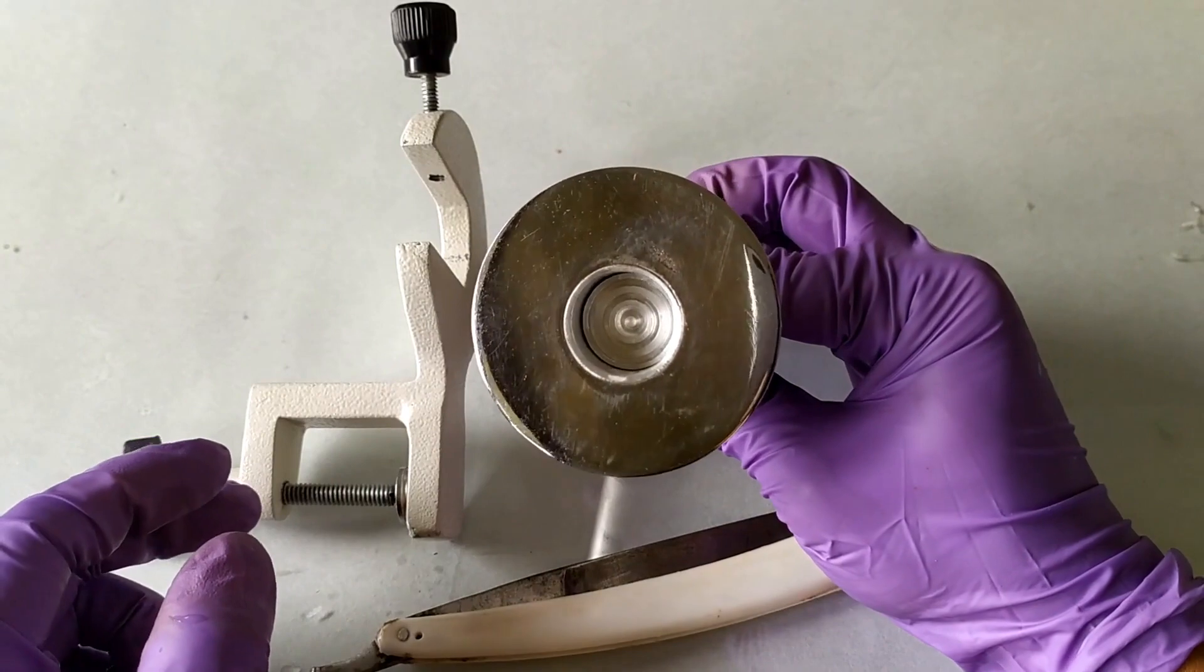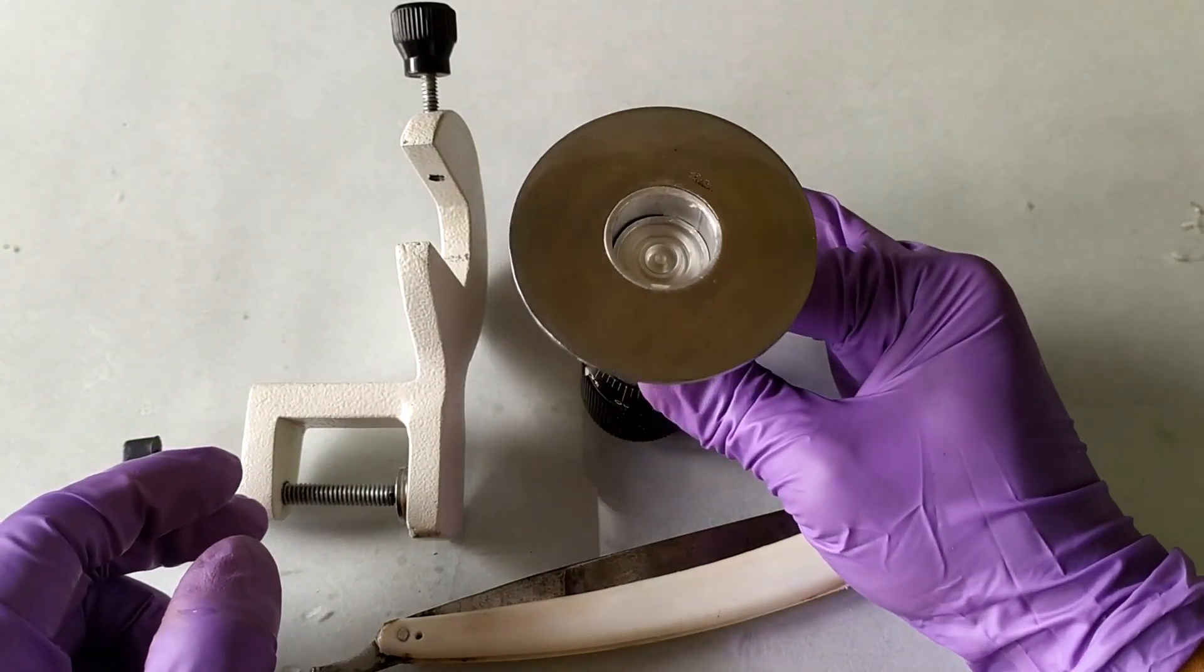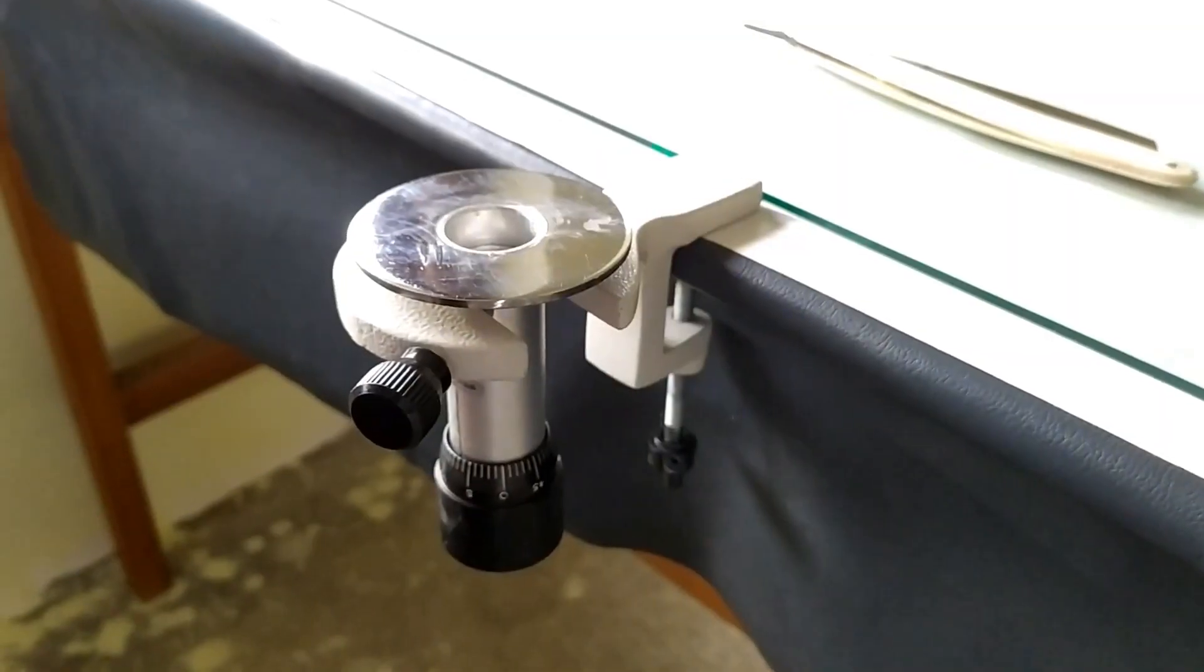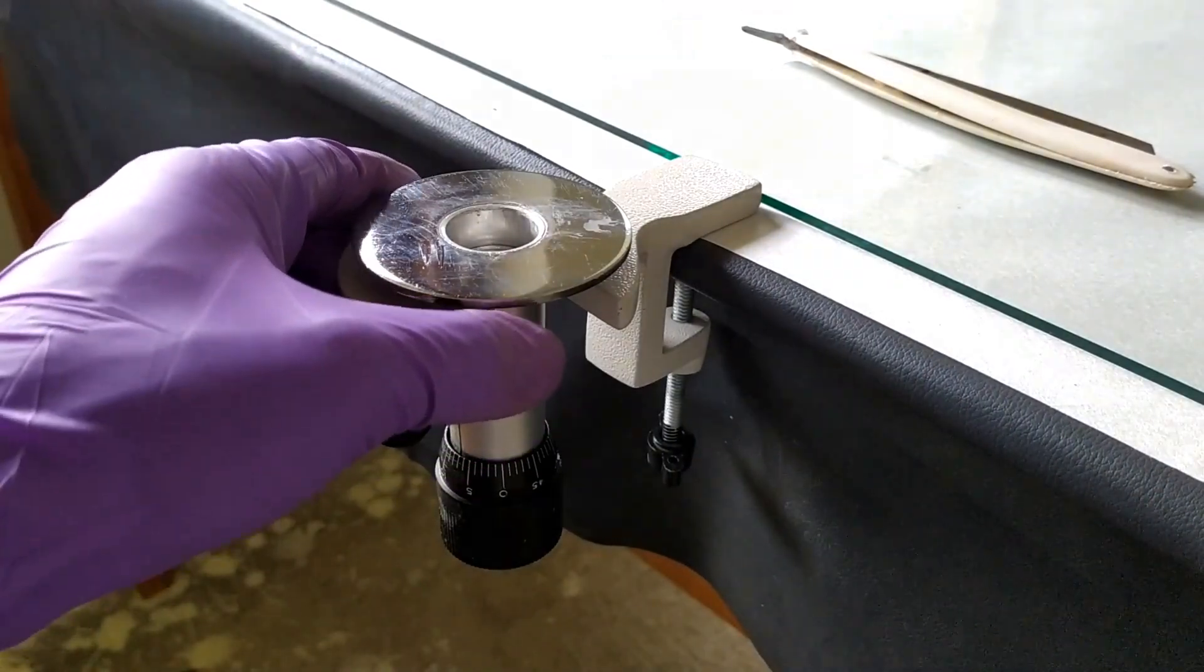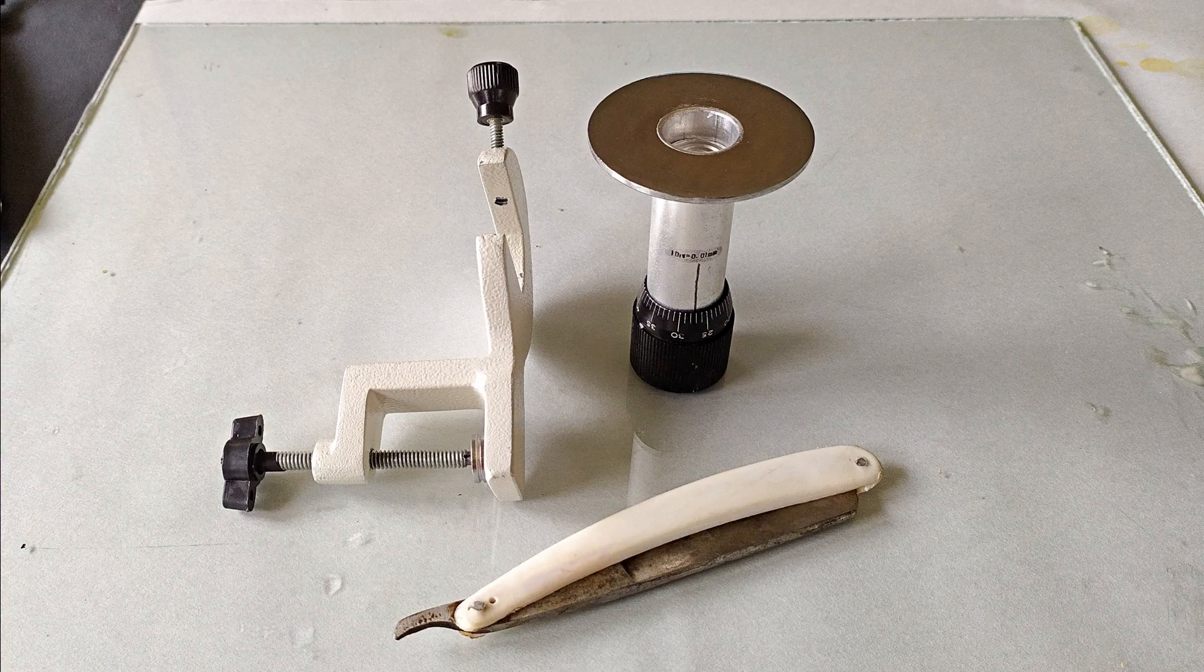The hand microtome can be used either as a handheld tool or a table top device if you couple it up with the table clamp accessory that comes with the microtome. A typical unit also usually comes with a razor blade.